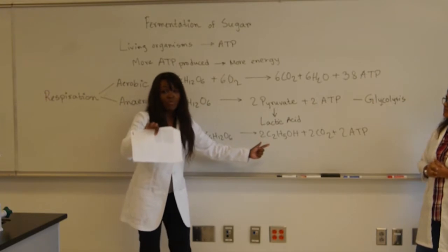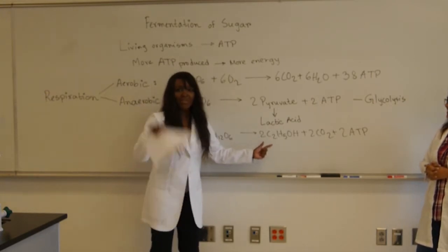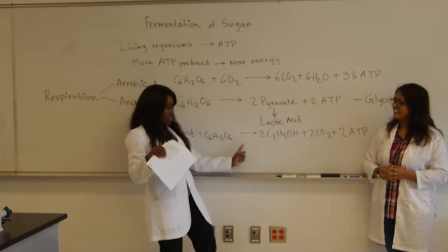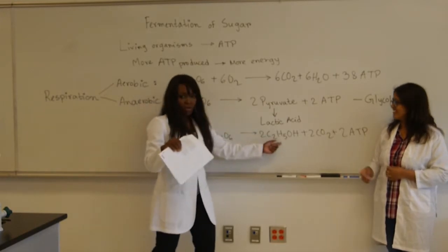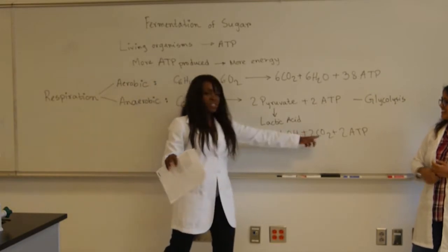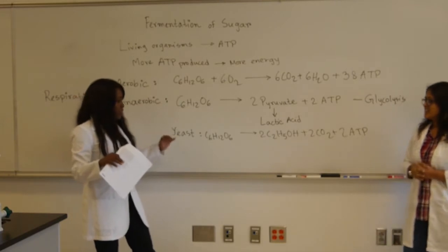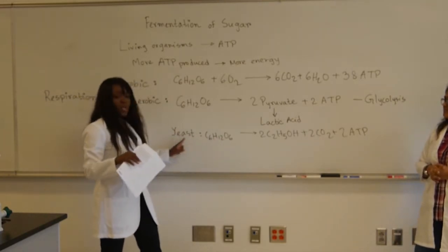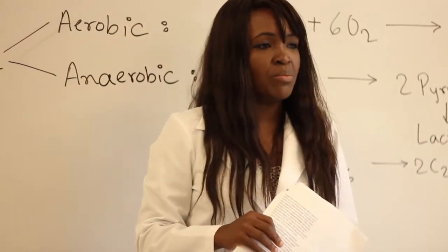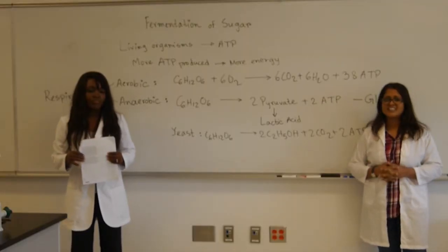If you're above 21 and it's okay for you to make alcohol, you will follow the same process and force the yeast to make alcohol. If you're baking, that's legal at any age. You force the yeast to make carbon dioxide, and that's what makes the bread rise. But our goal here is to make this ferment, so we will not give the yeast any option but to go through the anaerobic step to make our ATP. It should be a fun lab. So that's the lab.